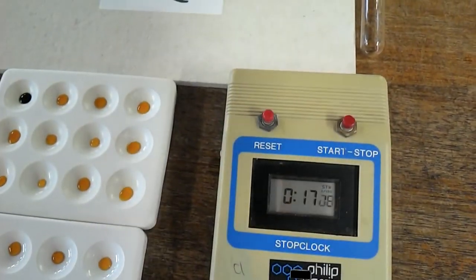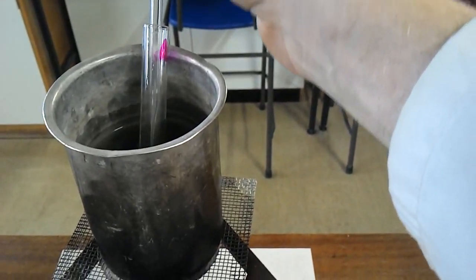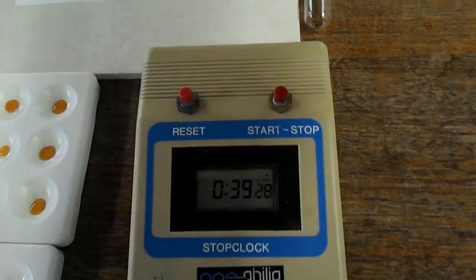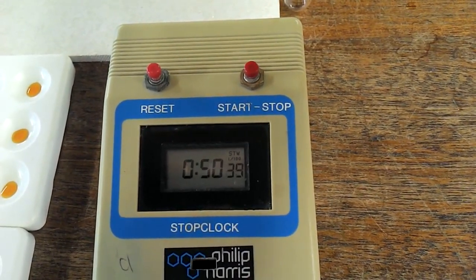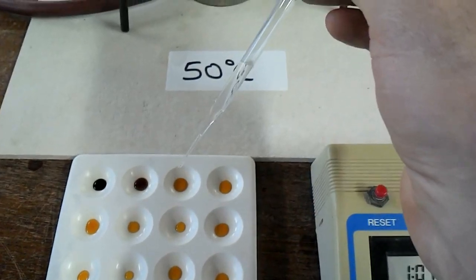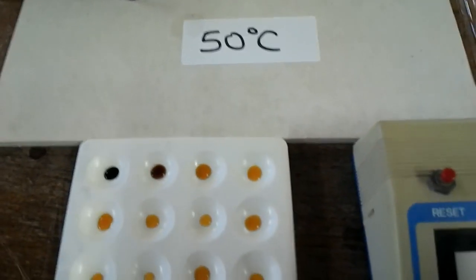Okay. So remember your tube is still in the water bath, and we're coming up to 25 seconds. We can start collecting our sample. Here it goes, and drop. In it goes at 30 seconds, which we're already seeing a change. Right, coming up to 55. Okay, so we start taking our sample. Take the sample ready, and in he goes. Bang. No change. So we had 0, 30 seconds. We're done, aren't we? Done by a minute.